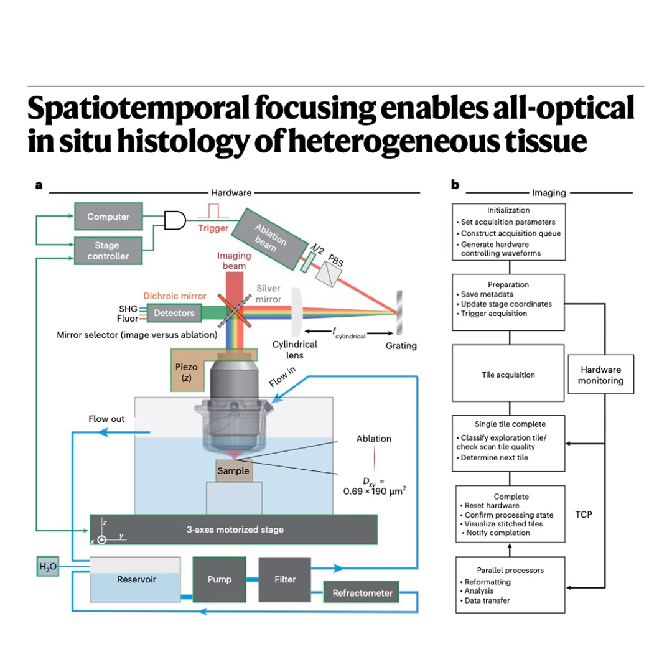Amazing. But you mentioned earlier there was a problem with previous attempts at this kind of thing. Yeah, the big hurdle was speed. Plasma-mediated ablation with a tiny point focus works, but it's slow. Painfully slow if you want to map something as large as an entire mouse brain. Right, you'd be there for weeks, maybe months. Exactly. So the challenge was, how do you increase the speed, the efficiency of removal, without sacrificing that critical axial precision you need for serial volumetric imaging? You still need clean cuts, layer after layer.